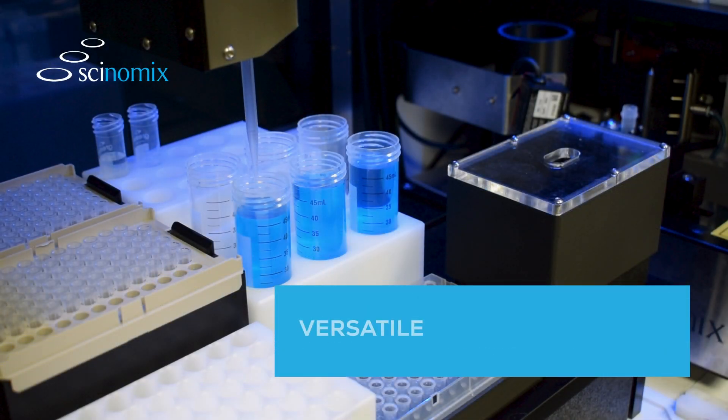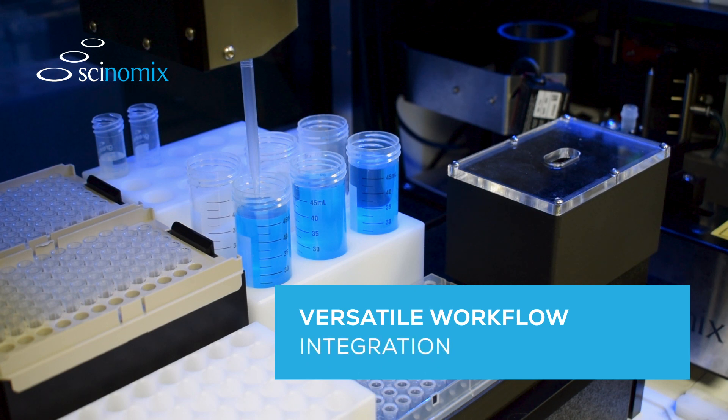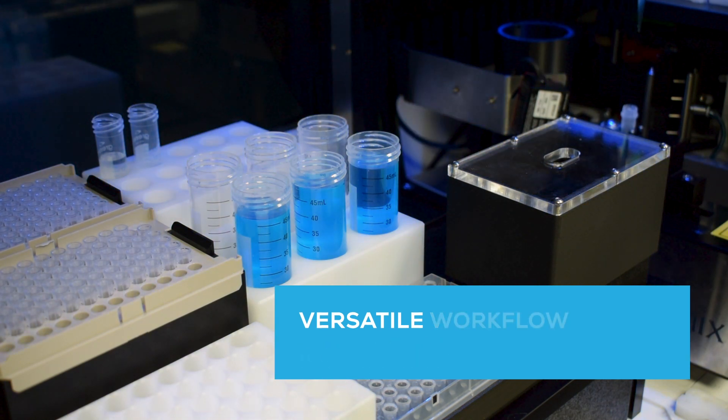Designed to support a variety of workflows including sample aliquoting, cooling, dilution, and reagent dispensing, the Synomics AQ is the most versatile and value-packed solution on the market.